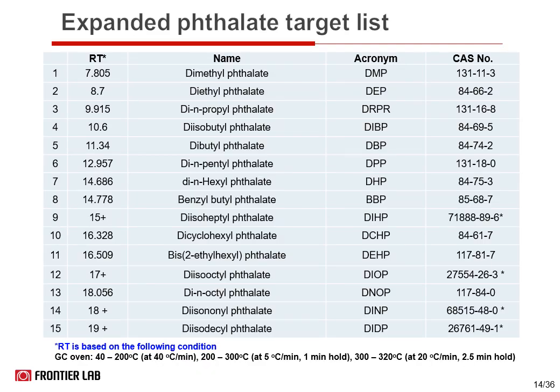This is just a reference. This is a list of phthalates that have been determined by the Py-GCMS system using the thermal desorption technique. In addition to the 7 phthalates, these phthalates can be analyzed by the Py-GCMS system.